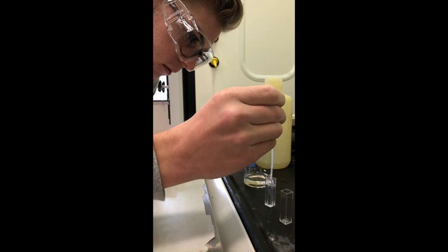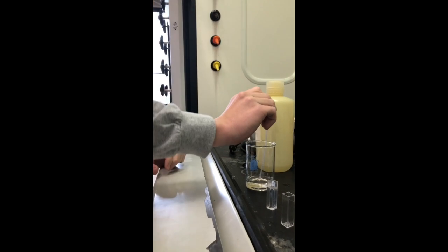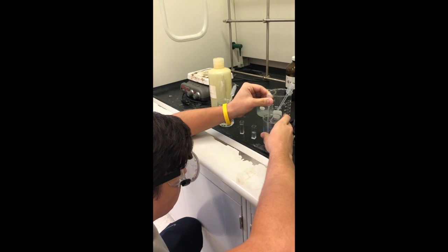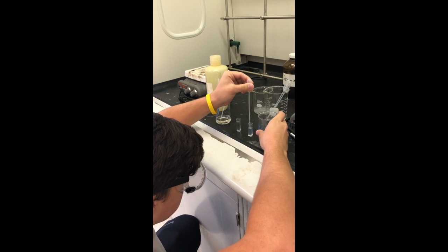To start this experiment, students had to fill cuvettes with a stock solution, dilutions of the stock solution, and a solution which would act as a blank in the spectrophotometer.